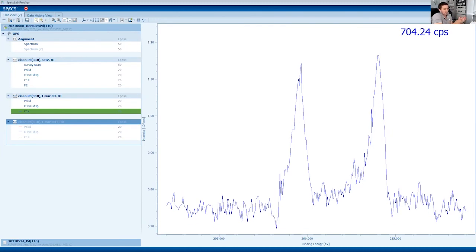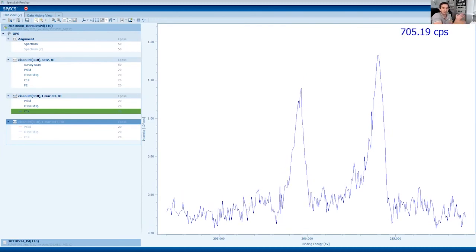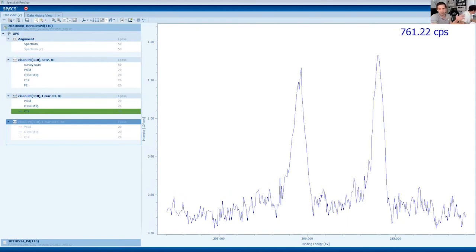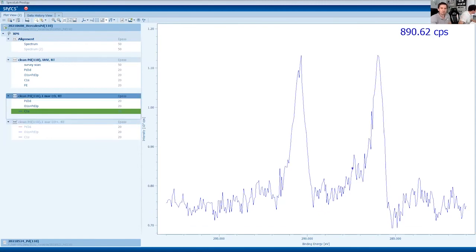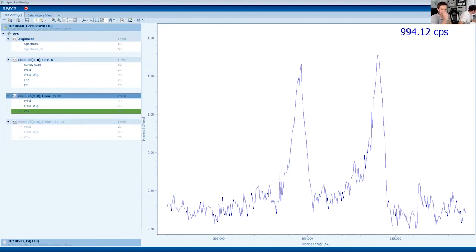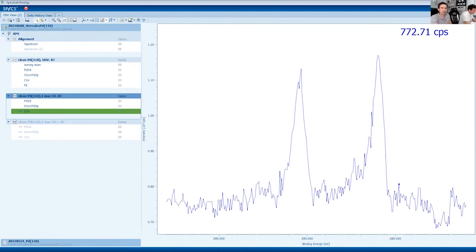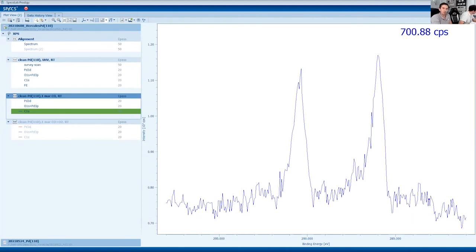If you plan studies like this, it is good to plan several experiments on one sample: a reference experiment with the gases separately, then with the mixture, and so on. This is how people usually write their proposals. They should put in the exact experimental plan, each step, so we know what to expect.